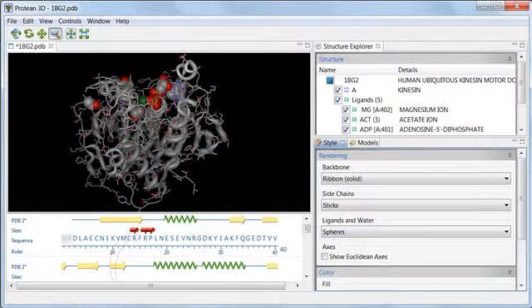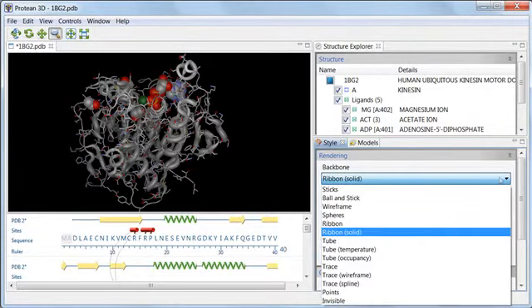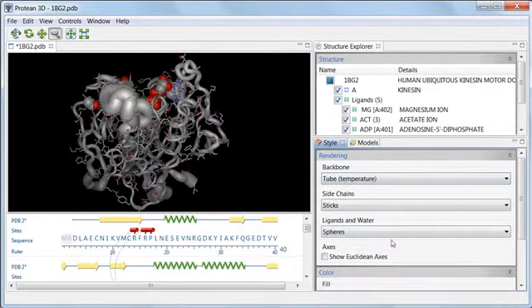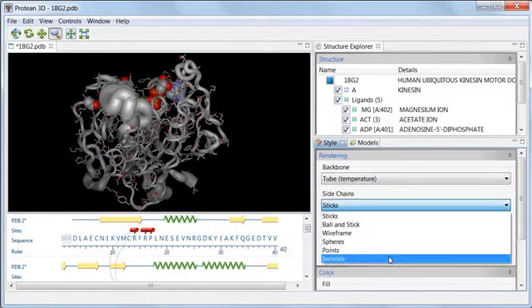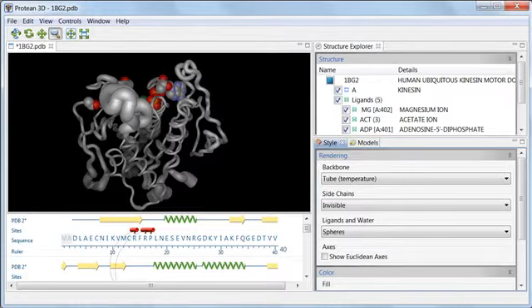I'll start by showing what happens when I choose tube temperature for the backbone and invisible for the side chains. In the tube temperature style of rendering, the tube thickness is proportional to the B factor measured in X-ray crystallography experiments.